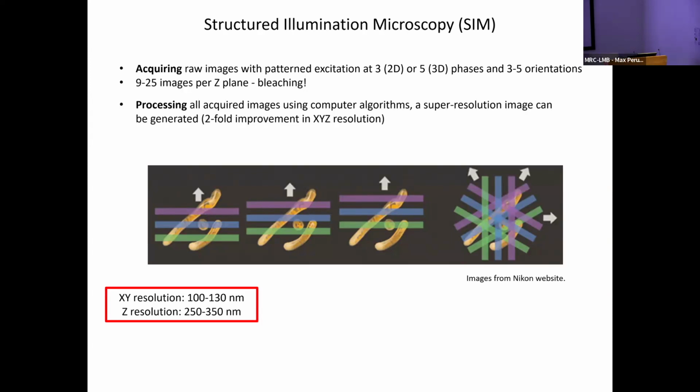So you do 3 shifts like this that are also called phase. And that allows you to cover your entire sample, but that's covering in one direction. The Moiré fringes are generated by seeing organization in your sample. And so to cover the entire sample, you also do rotations of that pattern. And the combination of this can be computed to resolve the structure of your image. So that's the SIM processing.